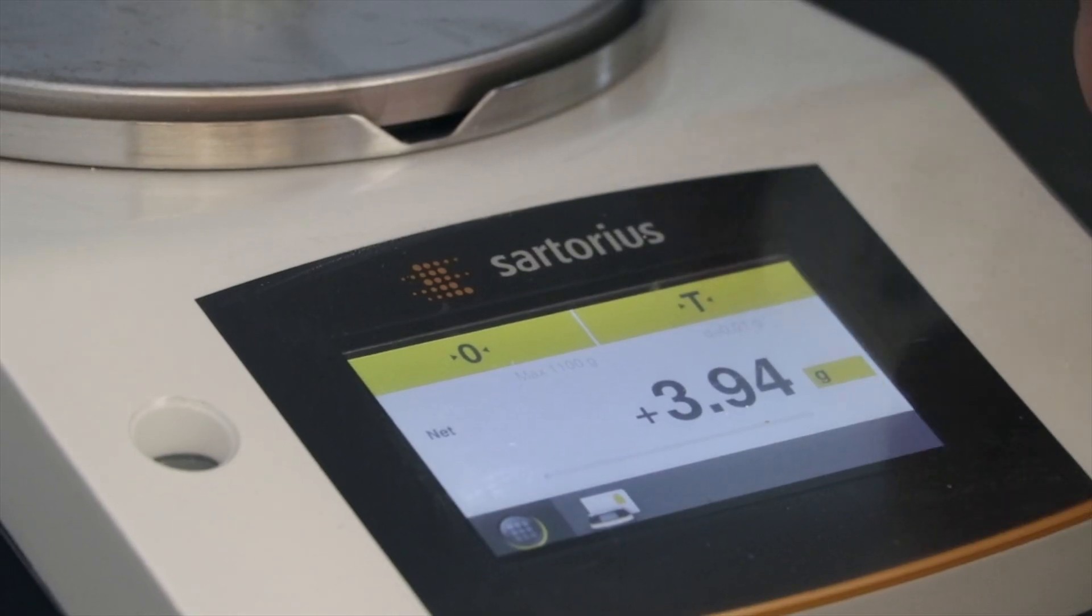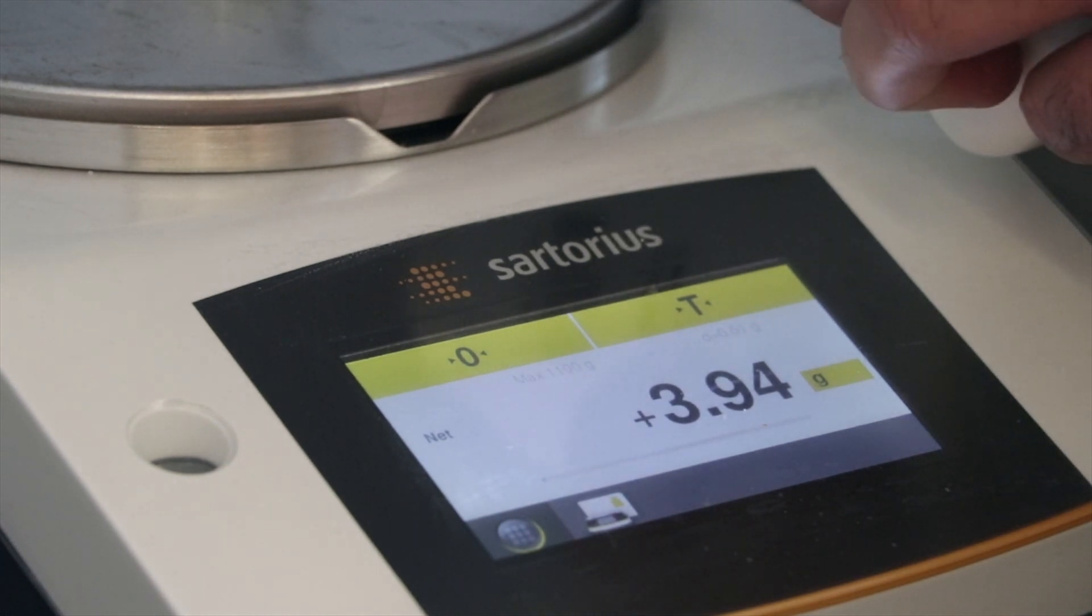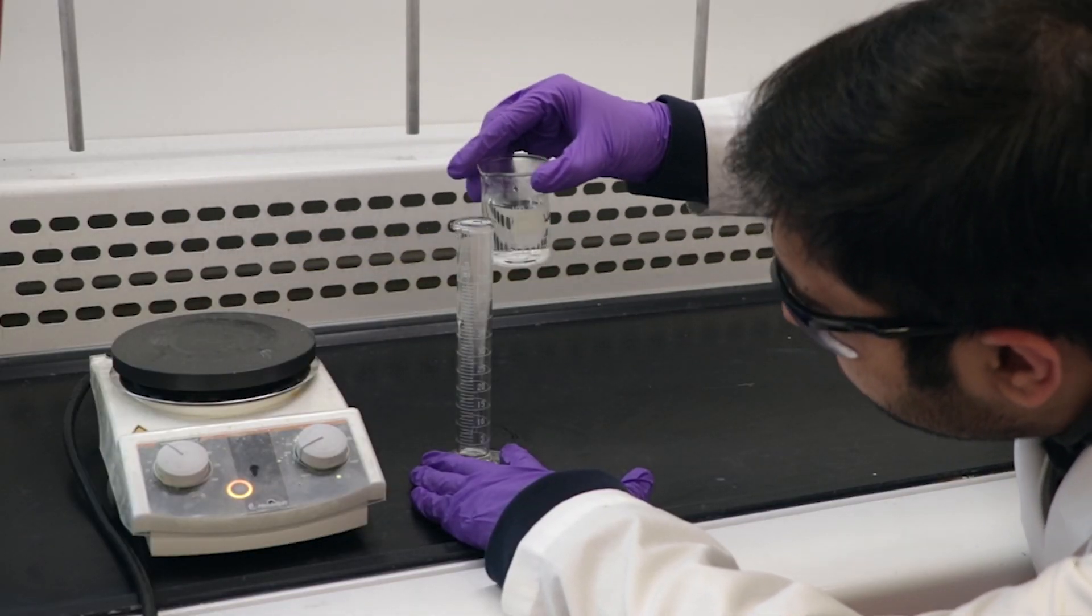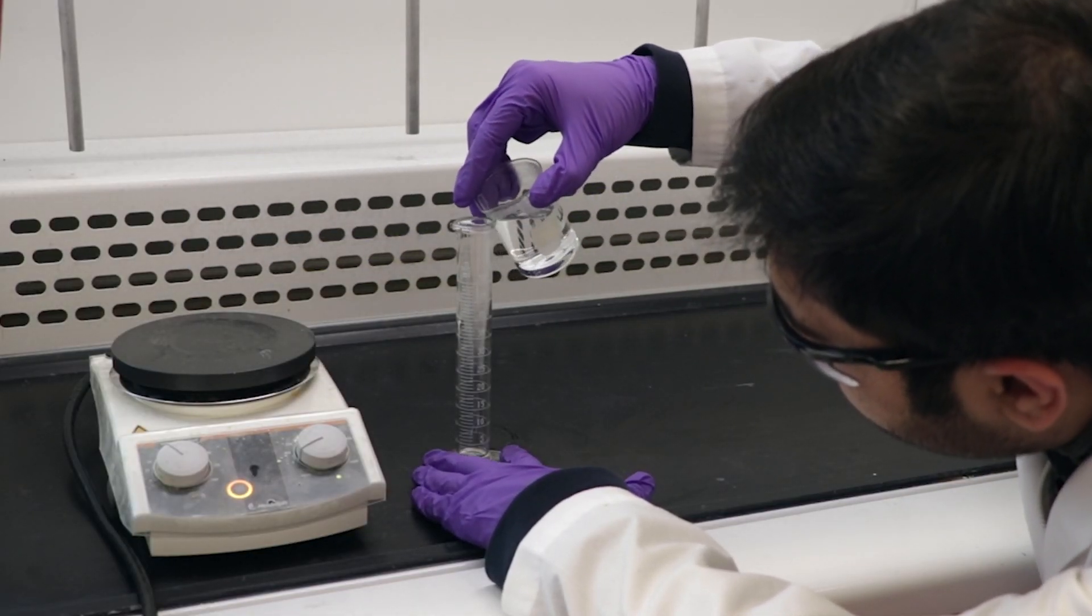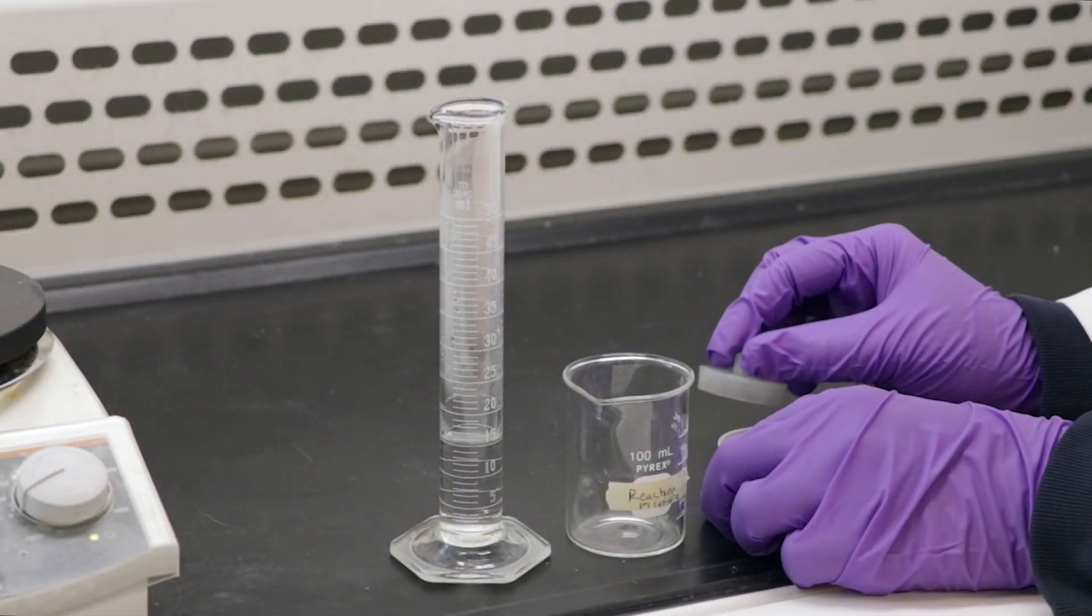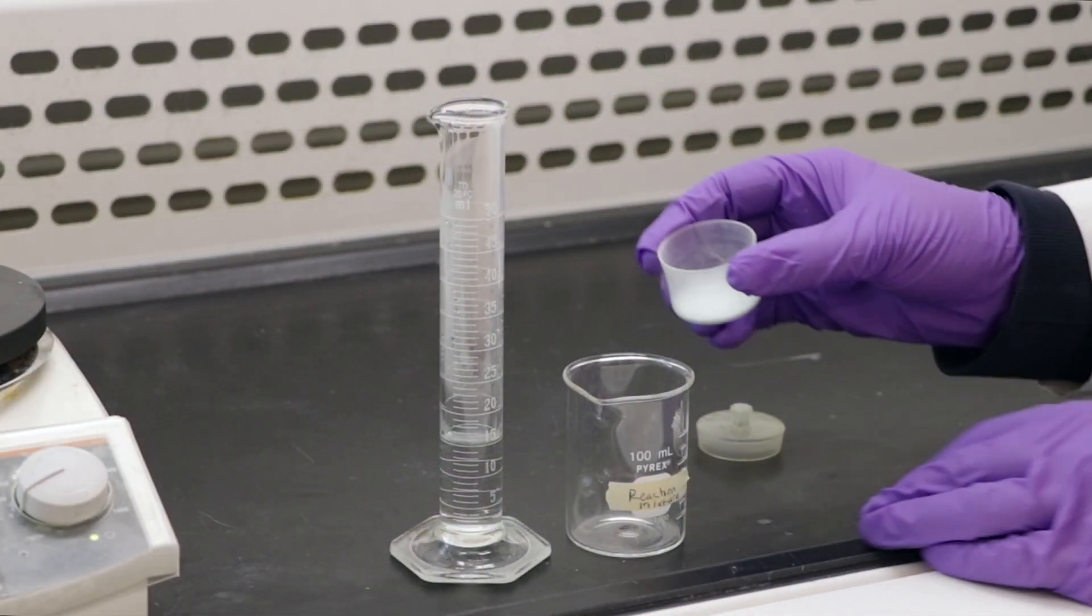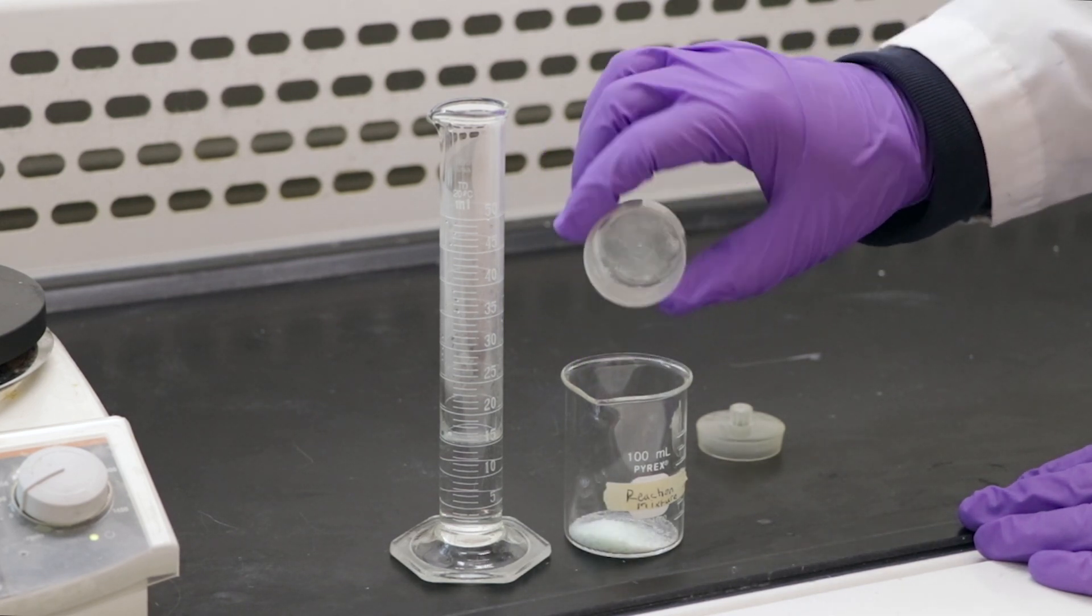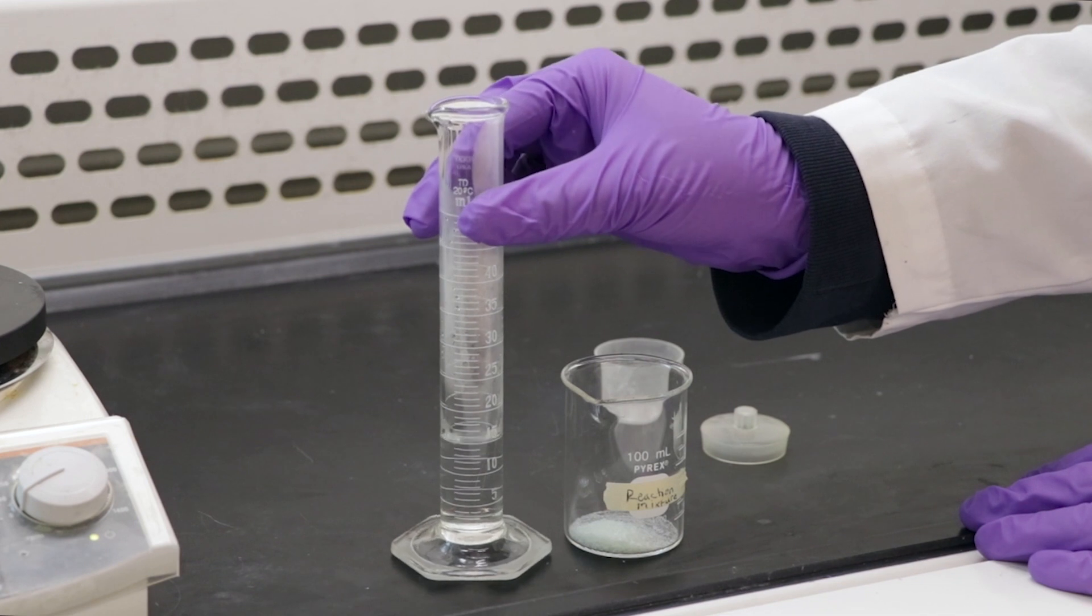This will be important when calculating your theoretical and actual yield at the end of the lab since this will be the mass of your limiting reagent. Take the ferrous ammonium sulfate back to the fume hood. Measure out 15 ml of warm water in a graduated cylinder. Add the ammonium sulfate to an empty 100 ml beaker and add the warm water.